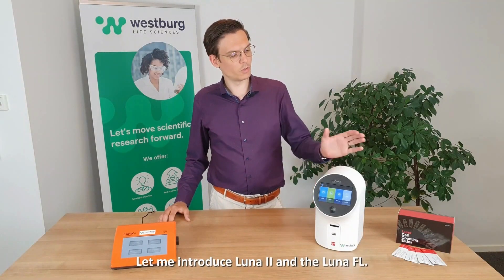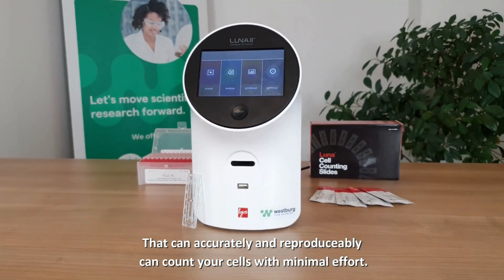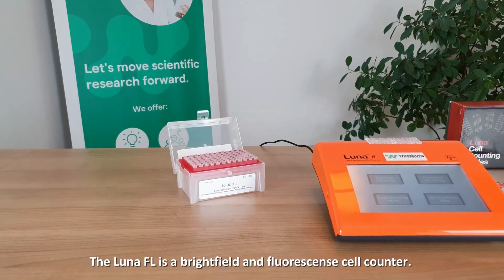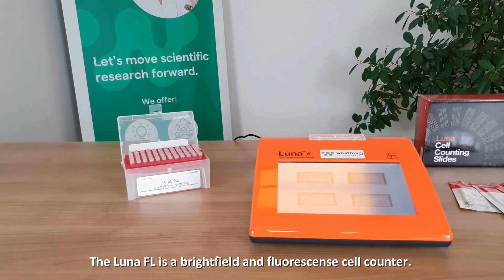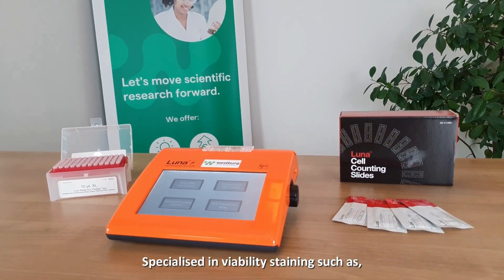Let me introduce the Luna 2 and the Luna FL — two very powerful automated cell counters. The Luna 2 is a powerful brightfield cell counter that accurately and reproducibly counts your cells with minimum effort. The Luna FL is a brightfield and fluorescent cell counter, specialized in viability staining such as Acridine Orange or Propidium Iodide, or you can use it to check your GFP transfection rates.